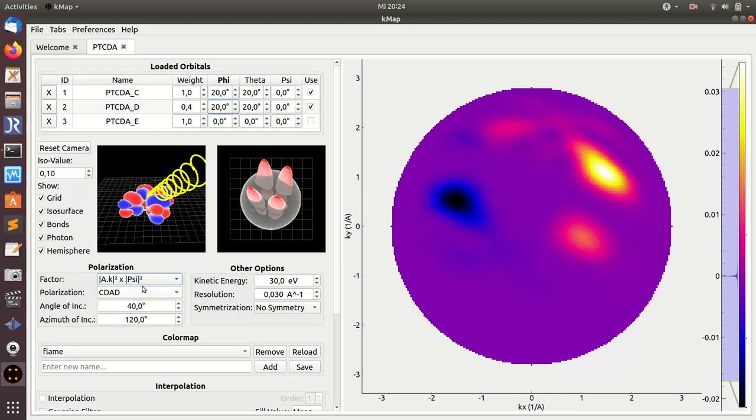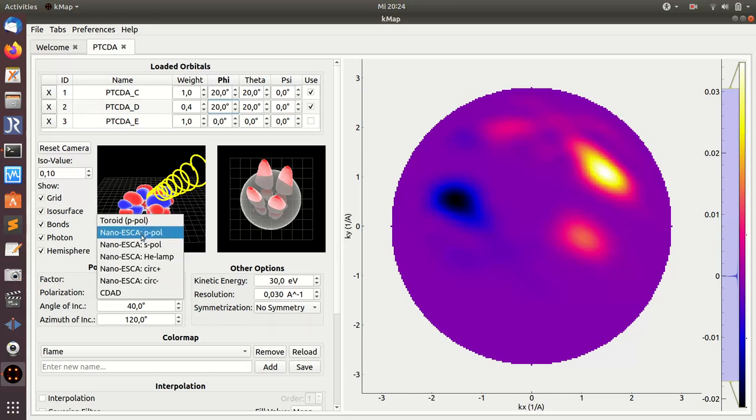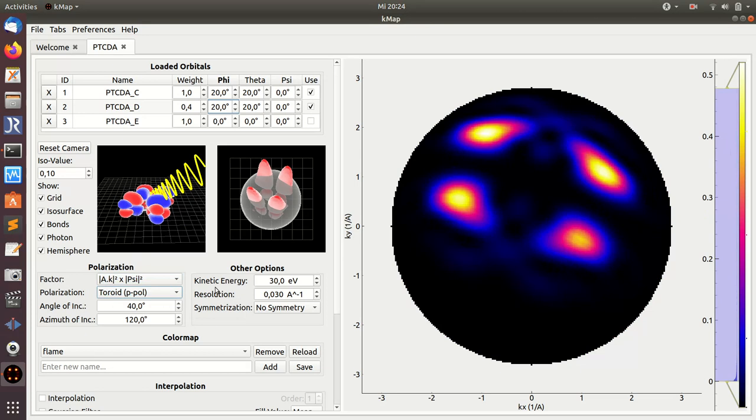Let's maybe switch back to toroidal P-polarized light here.